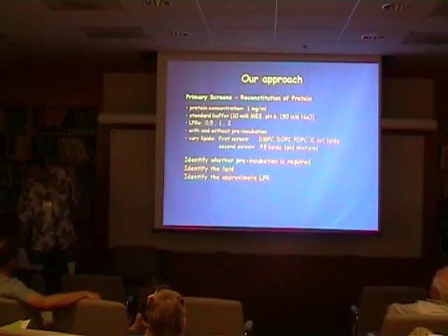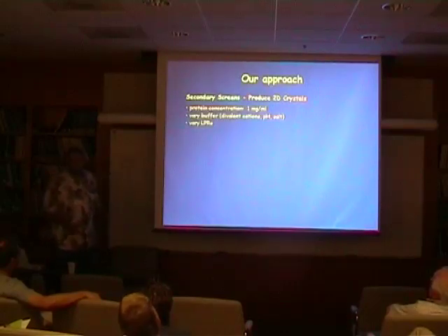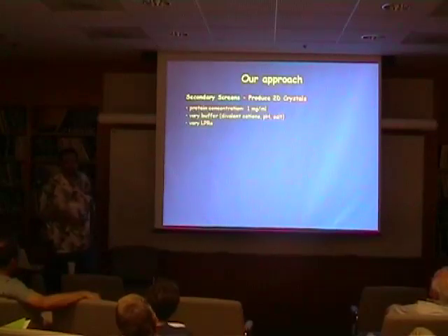So this is a primary screen, then we go to the second screen, and this is really the big one, where in this case we really want to try and get 2D crystals now.